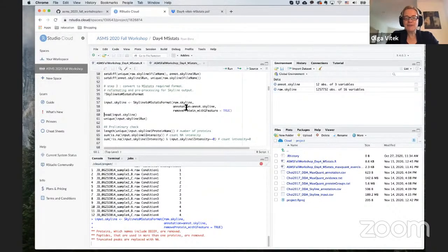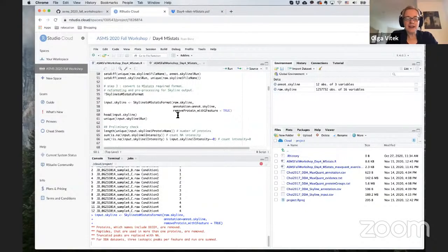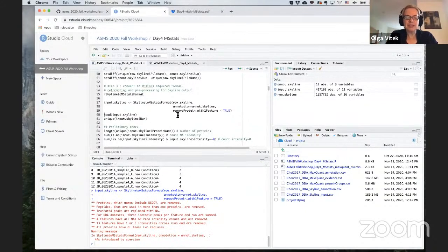And how do you define this? Well, there are multiple ways. You can select the top most intense features. MSstats actually has a functionality which selects, quote unquote, informative features and sets aside others, which you can either explore by hand, maybe, for example, if they have PTMs or something like that, or you can just discard. But I think the short answer is that with one feature, often you don't know if it has interference or not. Too many features is not necessarily productive, but you want to have a few good quality features per protein.